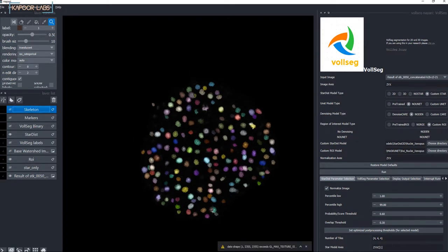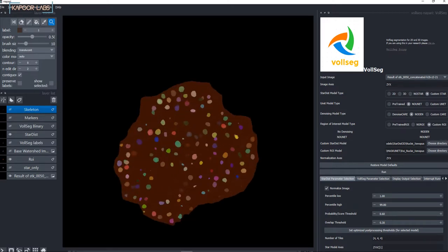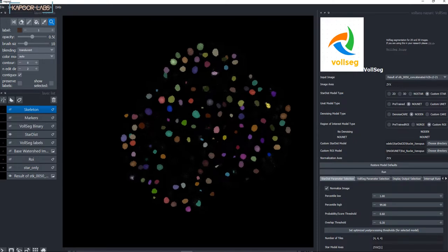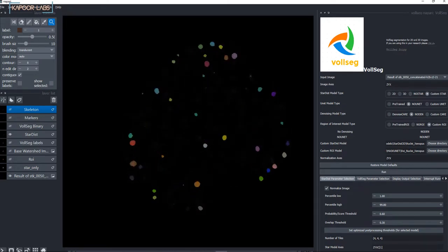And yeah, the data is too big, so this is the region of interest which you get from the region of interest model, and then the segmentation is performed in a bounding volume of this particular region: normalization, segmentation, and then you get the results which look nicer. It's too empty to actually see it in this view, but you can see it like this in the 2D sliced view. So the results are much nicer.